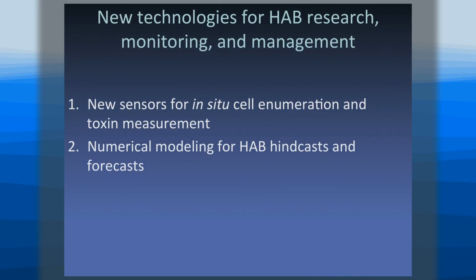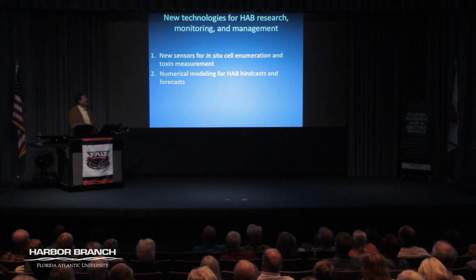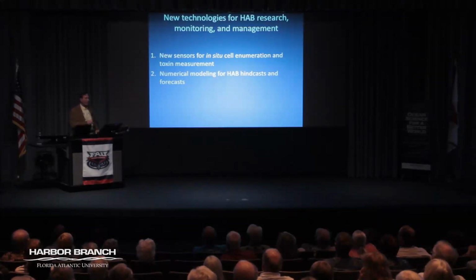But what I'm going to focus on are these 2. New sensors to try to count and measure toxins in situ. It means in place, like within the water, as well as numerical modeling for forecasts and predicting these blooms. And these 2 I have to show them because they fit together. Some of the rationale for doing this work is because we want to do that.